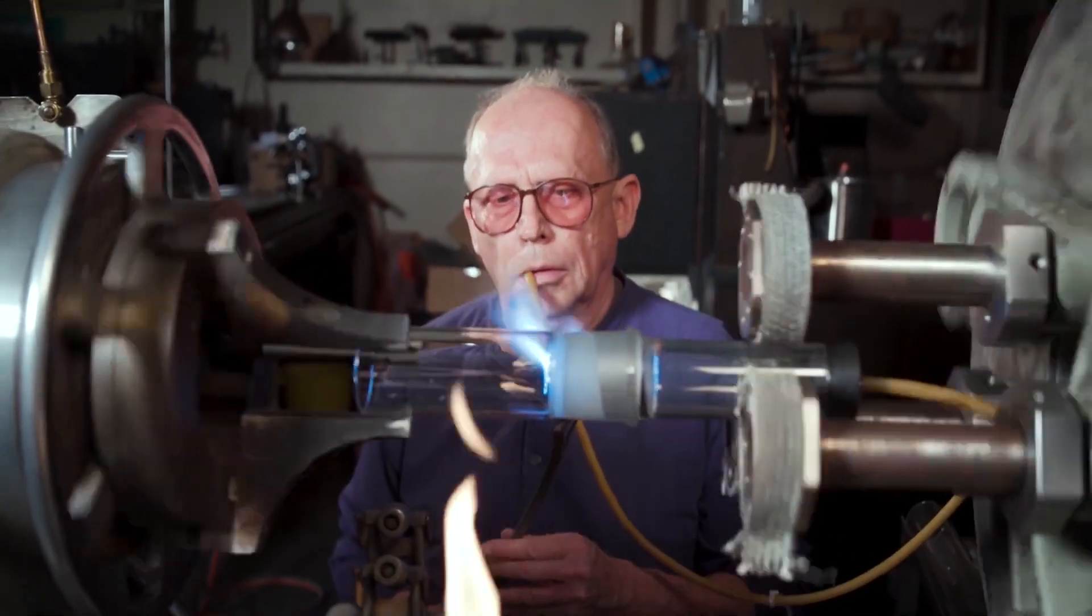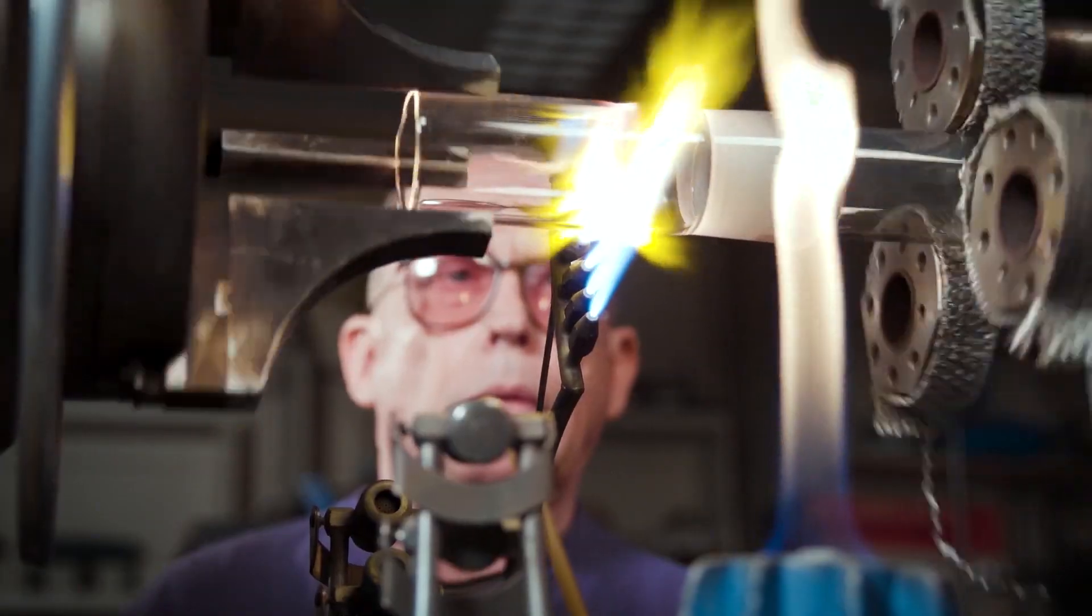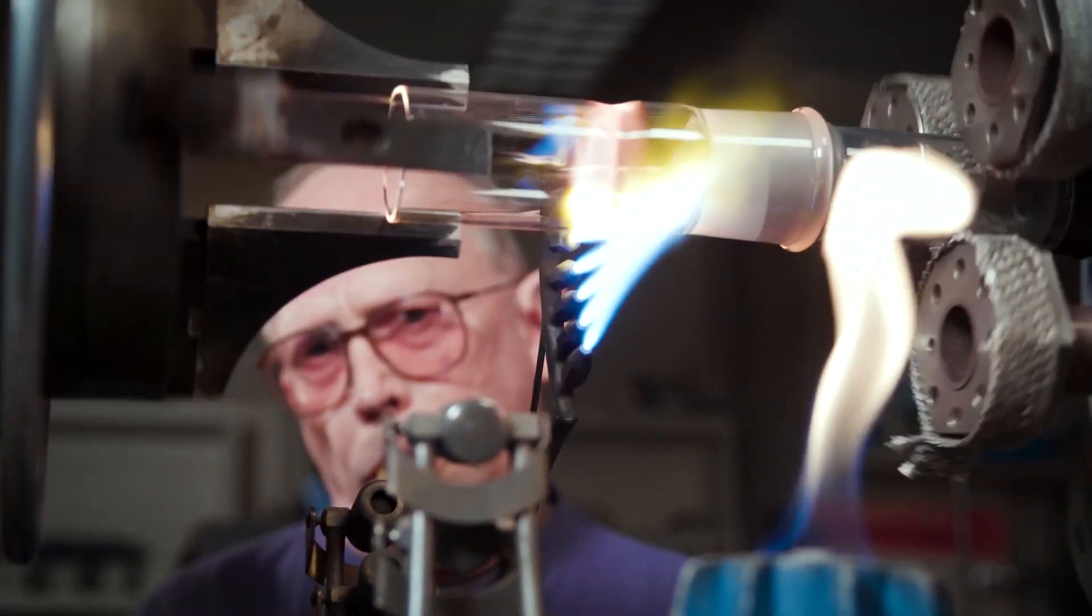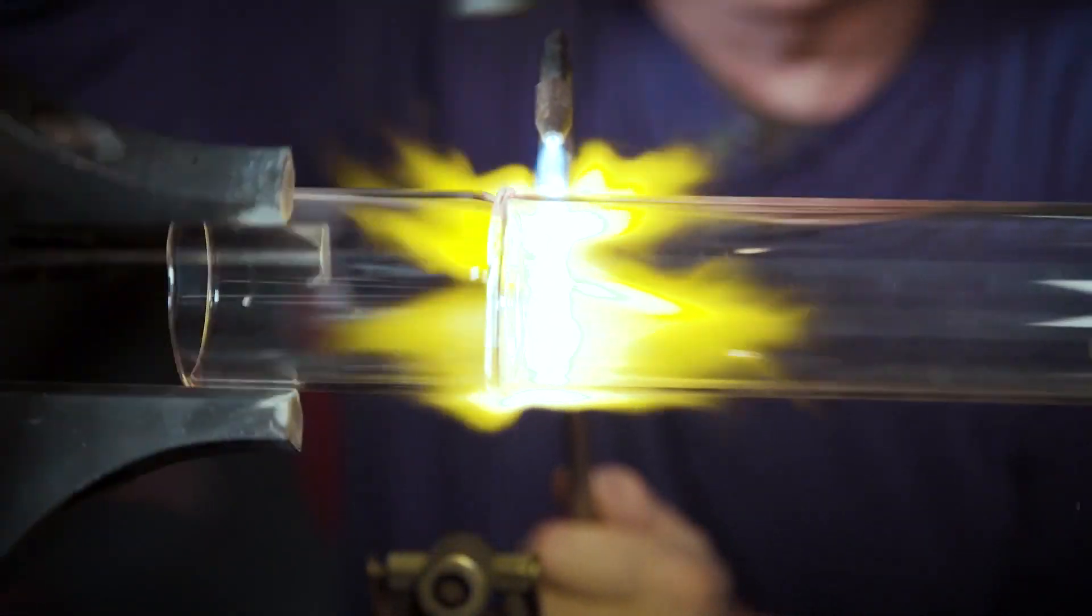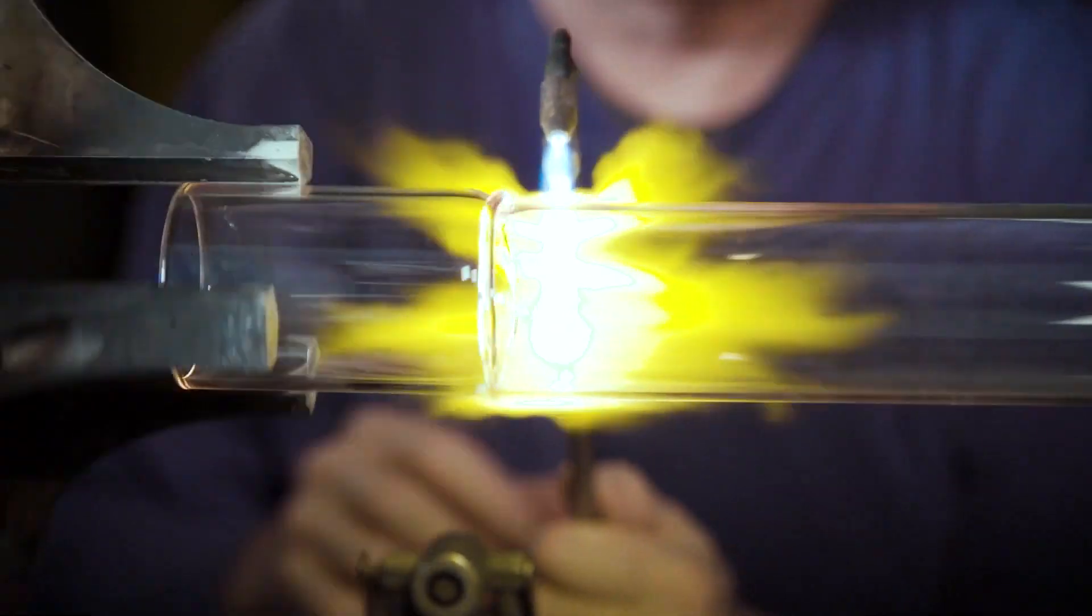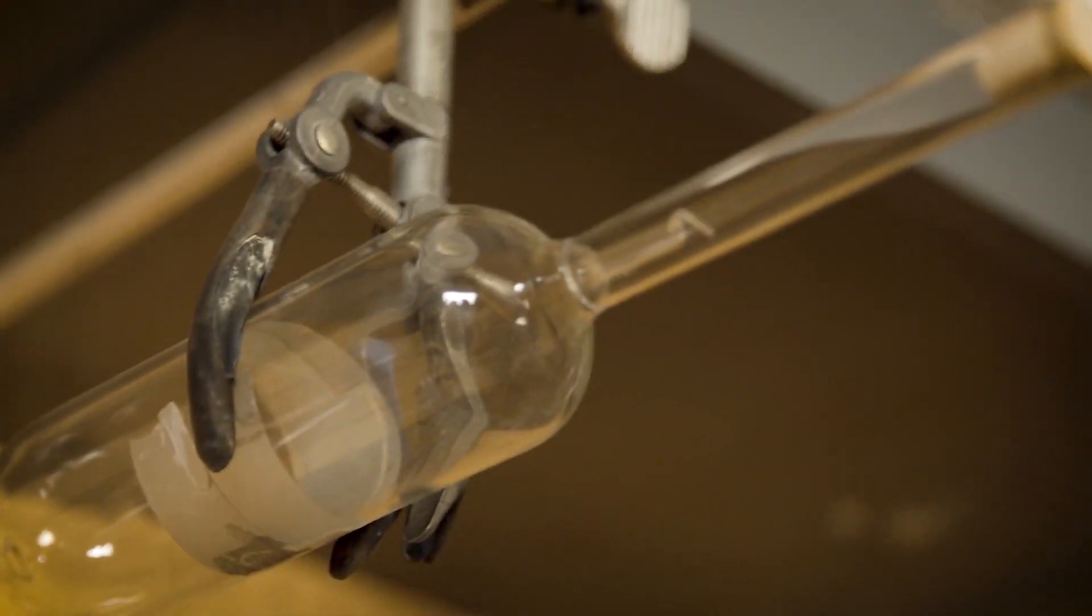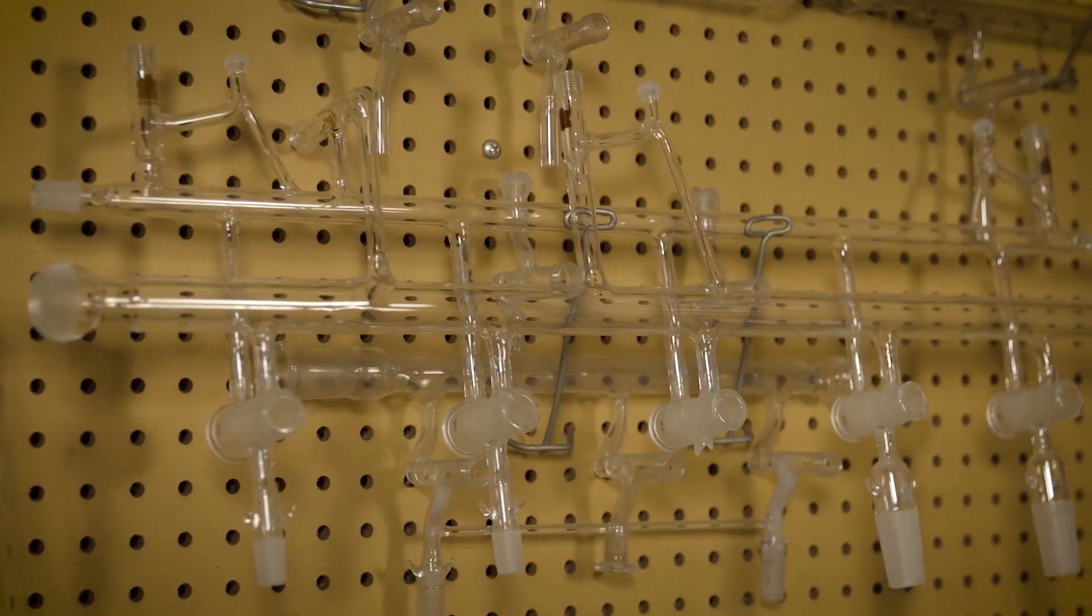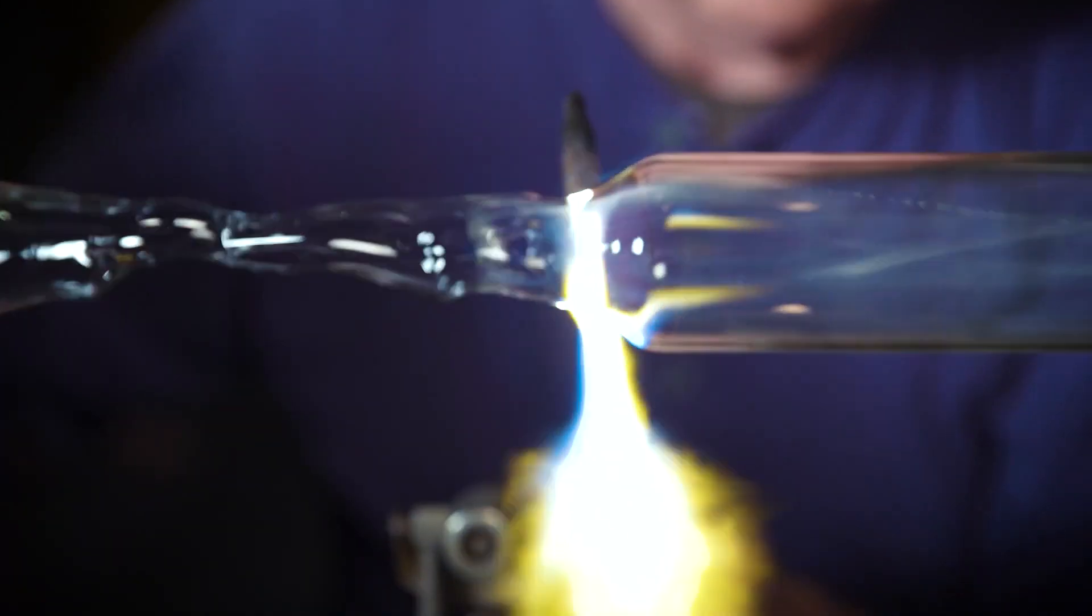My name is Jim Breen. I've been at Berkeley 16 years. I make custom glass apparatus for the researchers to use for their experiments. I don't make off-the-shelf test tubes and beakers and pedestrian glassware. My time is better spent making complex apparatus. I probably make about 500 pieces a year.